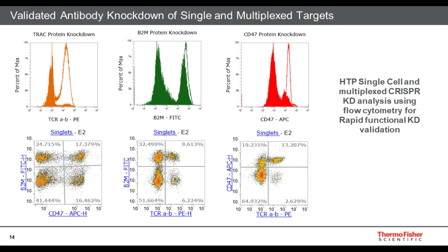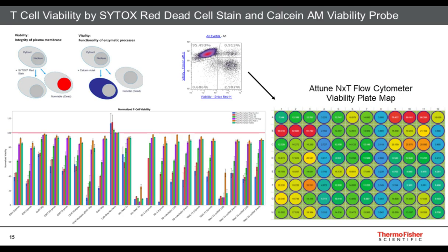Then you can look at these bivariate plots and look at your different populations. Flow cytometry also allows a lot of nice visual tools like hyperlog plots where you can really look at your expression levels and your populations and help to tease out and find that data.